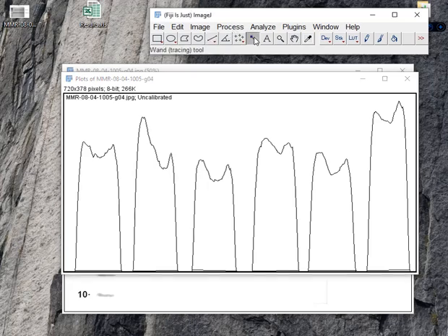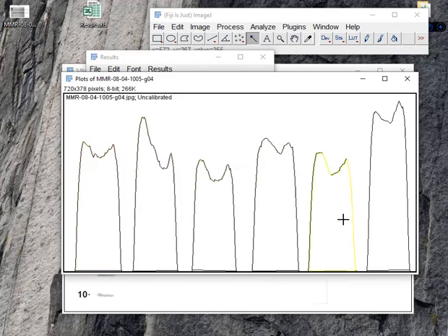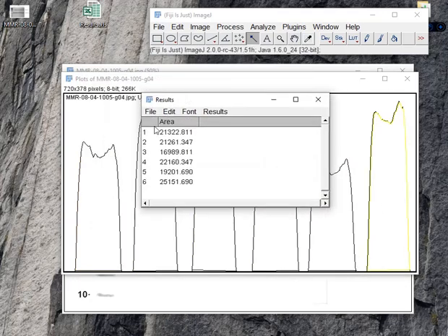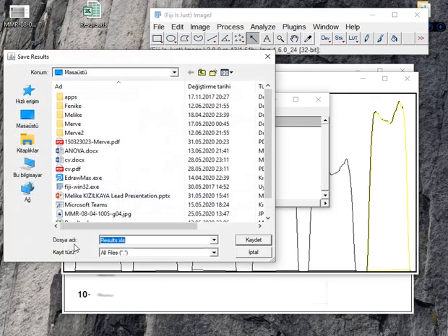And again I'm selecting the wand tool and I'm clicking all of these peaks. These are my area results. Again I'm saving it.